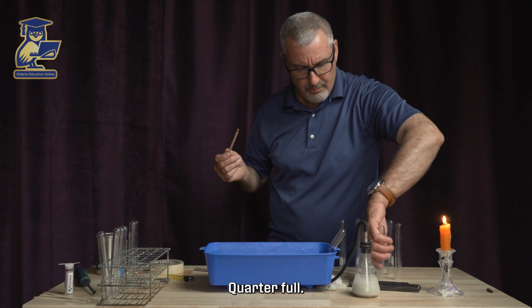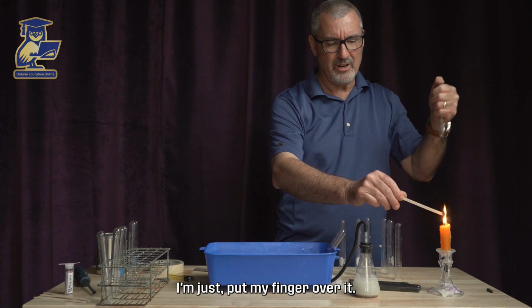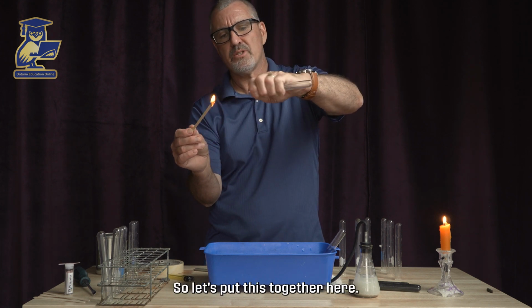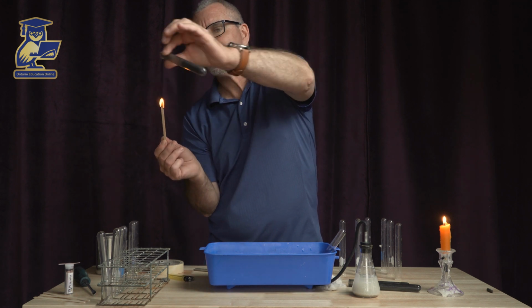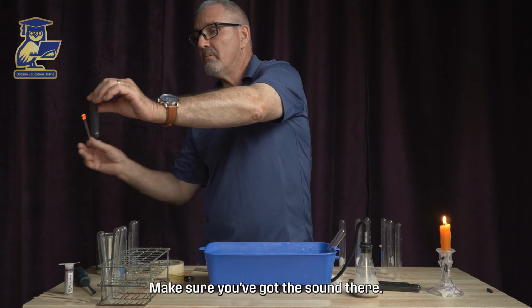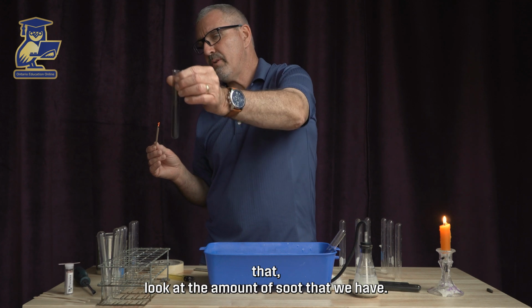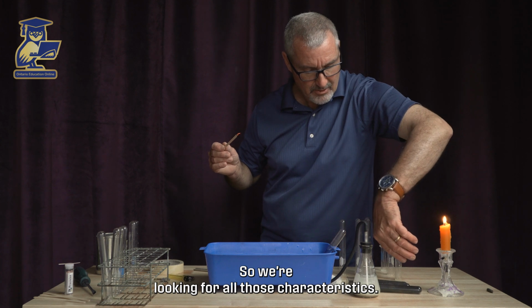All right, let's go quarter full. I'm just putting my finger over it. It's a little bit less dense than air, so if I took my thumb out, eventually it would leak out. Not horribly, but let's put this together here. Definitely a little bit different, and even the sound. Make sure you've got the sound there. Look at the amount of soot that we have. Again, where did it burn? So we're looking for all those characteristics.